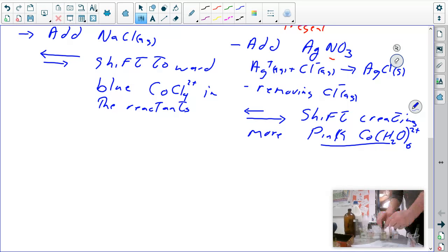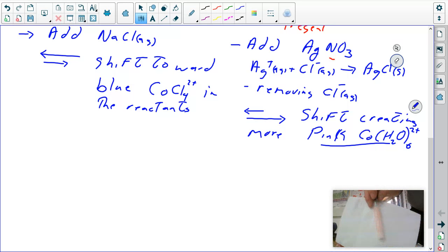And I will just do that right now. Again, this one we're going to have to look fairly hard for it. This is some silver nitrate. Now, one of the things that you can see, or at least I hope you can see, is in comparison to our original sample, it's got a lot cloudier for one thing. So that's that silver chloride solid being formed.